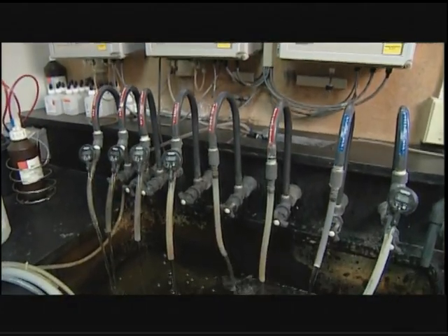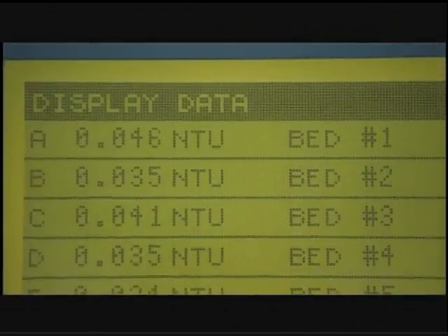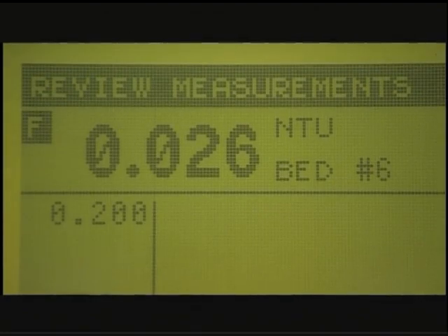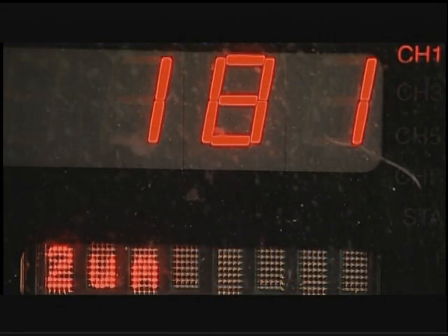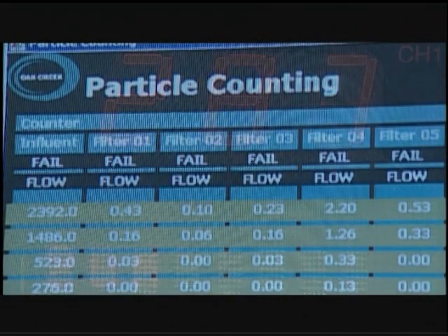Particle counting gives more detailed information than does turbidity, within similar measuring. For example, if you have a reading of 1 turbidity unit in a water sample, that reading could have been created by 1 large particle, or it could have been created by 1,000 small particles. While turbidity is a qualitative measurement of the amount of particulate matter in water, particle counters provide quantitative data on the size and number of the particles themselves.